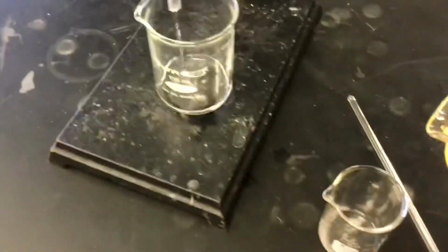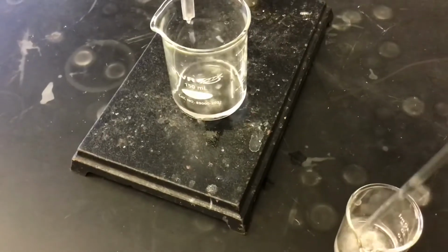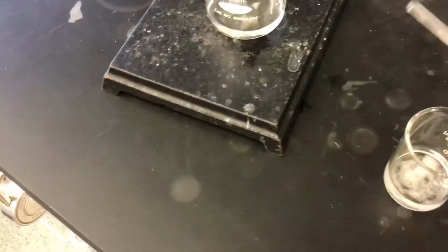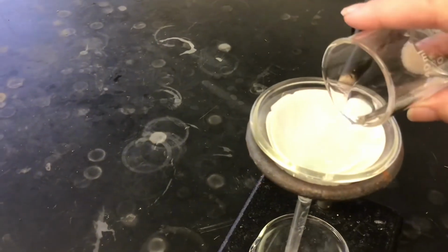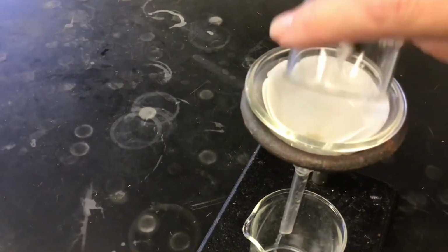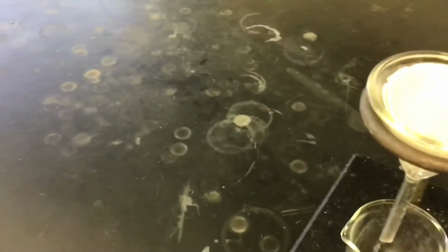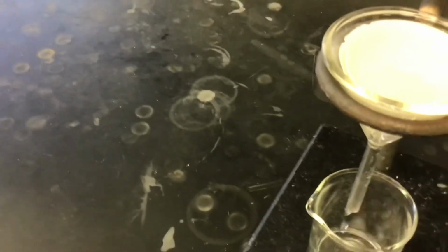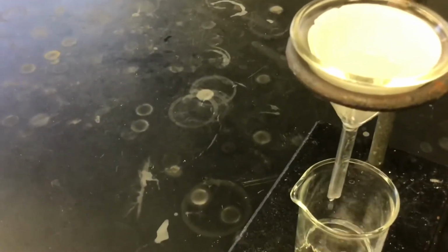So while that is filtering, I'm going to pour some more water in here. Okay, and then I'm going to stir. Again, trying to get all of that salt to dissolve, just leaving behind the sand. Okay, so I'm going to pour that in. Okay, and then you can see it. Now they tell you to do it one more time, so I got a little bit more water. We're going to swirl that around, and we are going to have that in there.